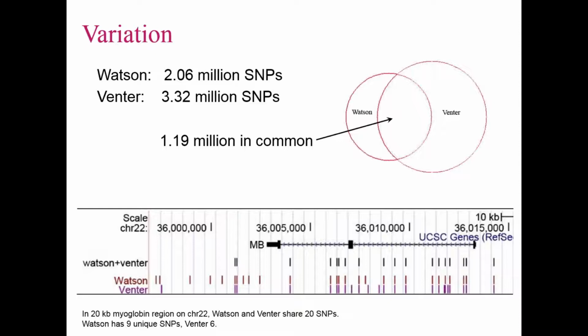And then if you subtract that from the variation of the child, what's left over is a graphical representation of any de novo variants that occurred during the formation of the gametes that arose in that child. And there are a number of other ways you can think of how to use such a feature.